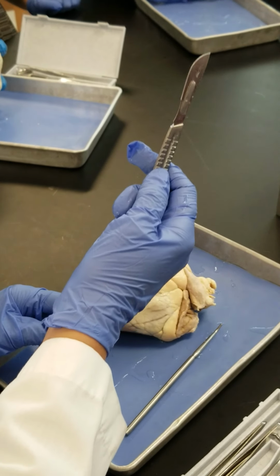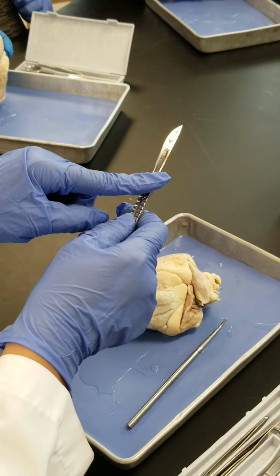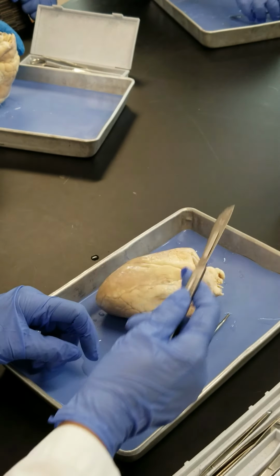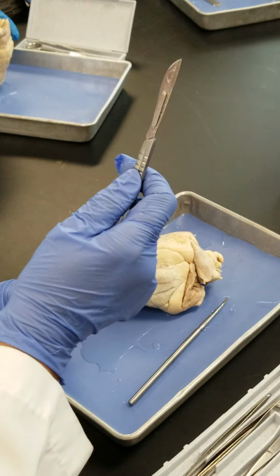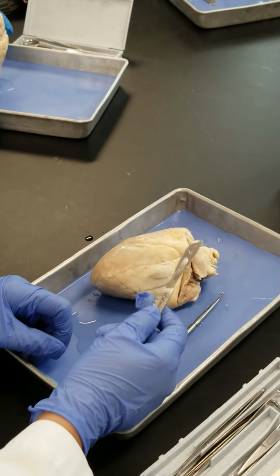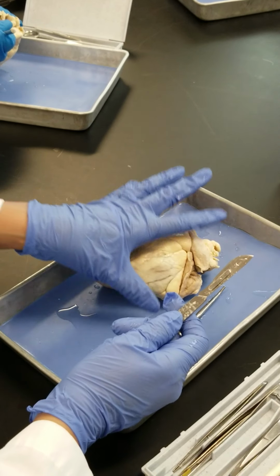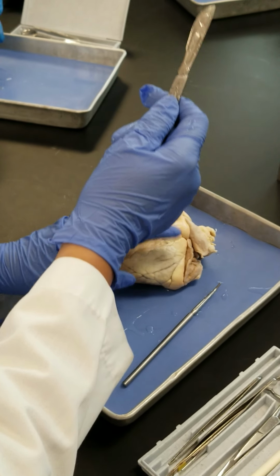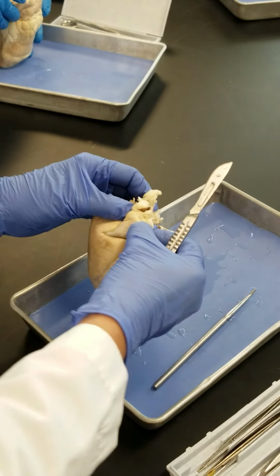But just make sure you are careful working with the scalpel. These blades are very sharp, or can be very sharp, right? So make sure that you are cautious about using these ones, and specifically the ones that you do not have in hand, right? You cannot know exactly what the other person that has this blade in hand is going to do, right? So whatever you are going to do, put your finger, point at something, or whatever you want to point at, just make sure that the other person that has this one in hand knows where your other finger is going, right? So be very careful about those ones, right?